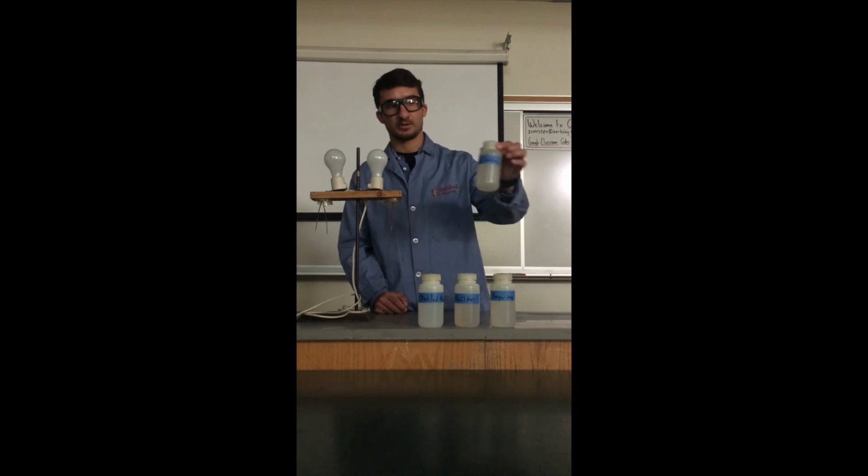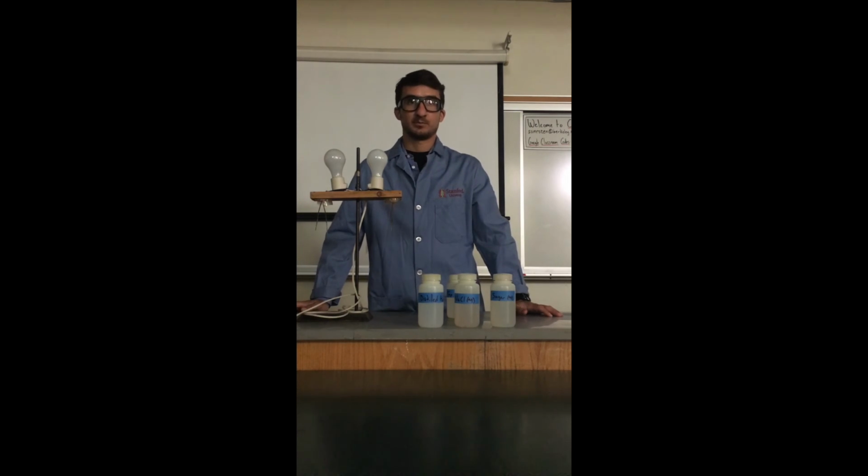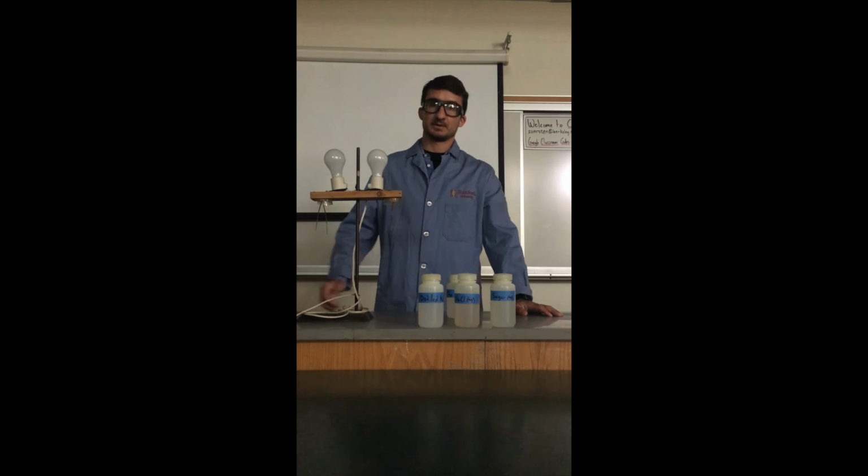And then the final one is tap water. Now tap water, distilled water is just H2O. Tap water is mostly water, but it has some other ions in it. Some calcium, sodium, magnesium, chloride, fluoride. These are naturally occurring ions in water. In fact, when you buy drinking water or spring water, it lists the different ions and minerals present in the water. It's not necessarily good or bad. Some things in the water could be bad, and you need to keep track of that, but our water department monitors those levels to make sure we stay safe.